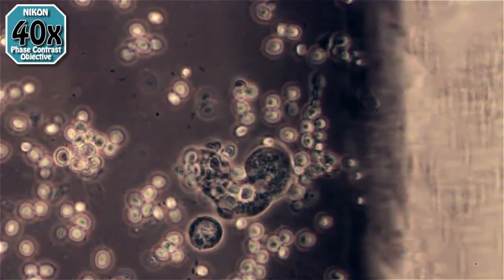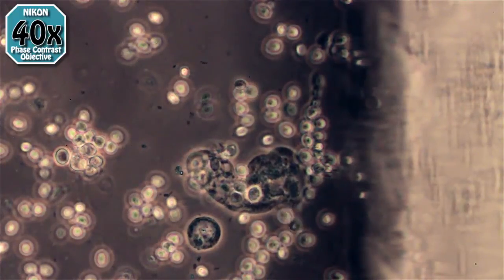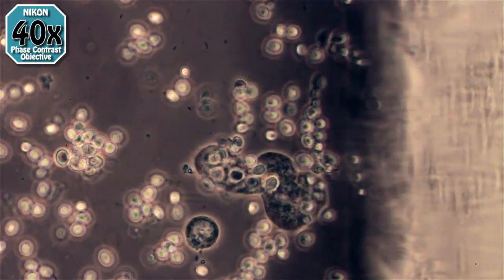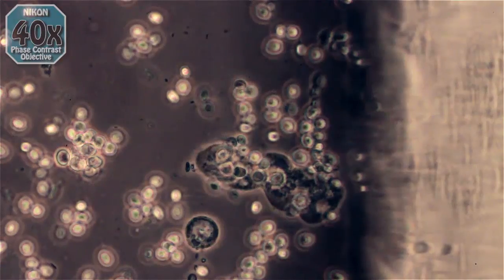This sample seems to be full of them right at this point. He's working his way towards the edge of the slide — working his way towards the cloud.